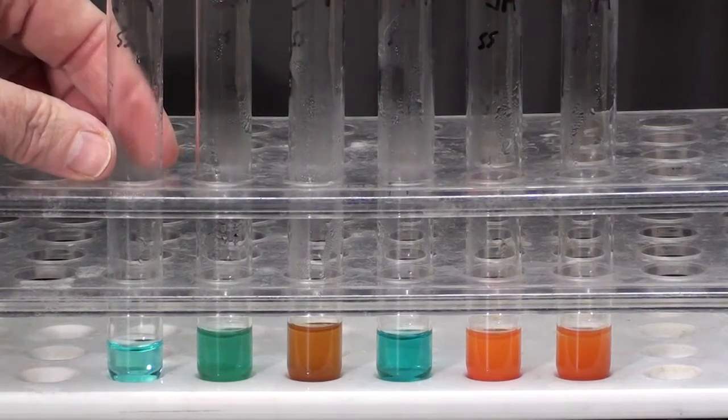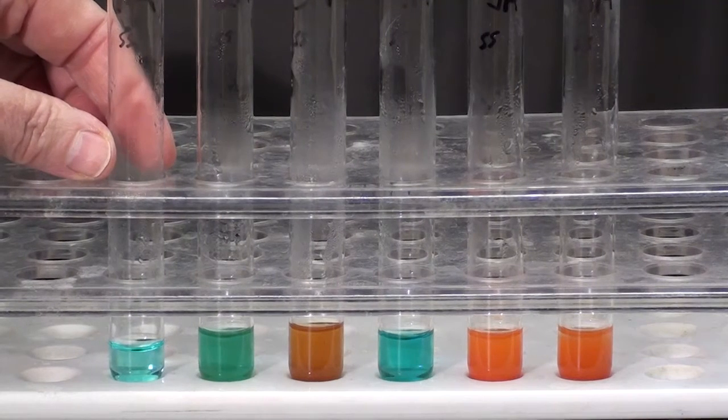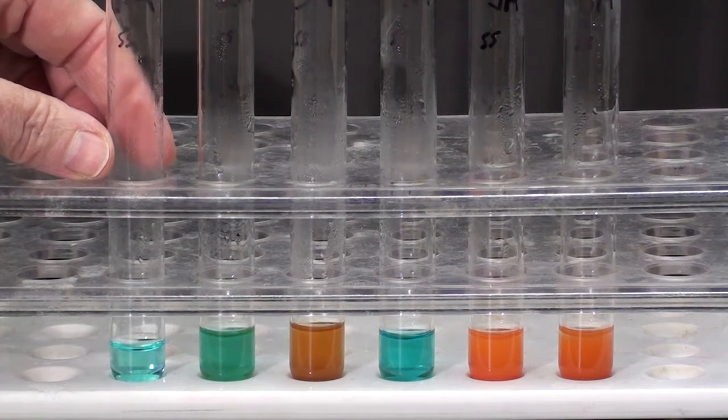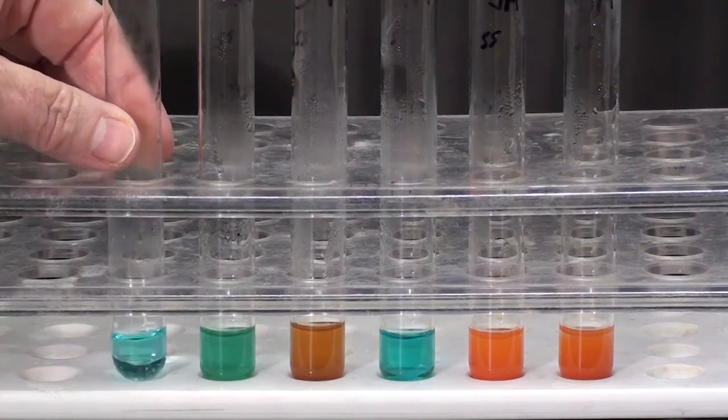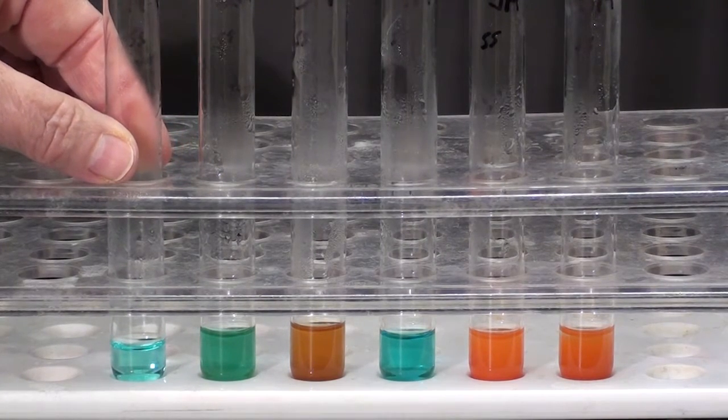Tube one started with amylase and water. It was placed in the body temperature for a half an hour. Benedict's is blue if no sugar is present.